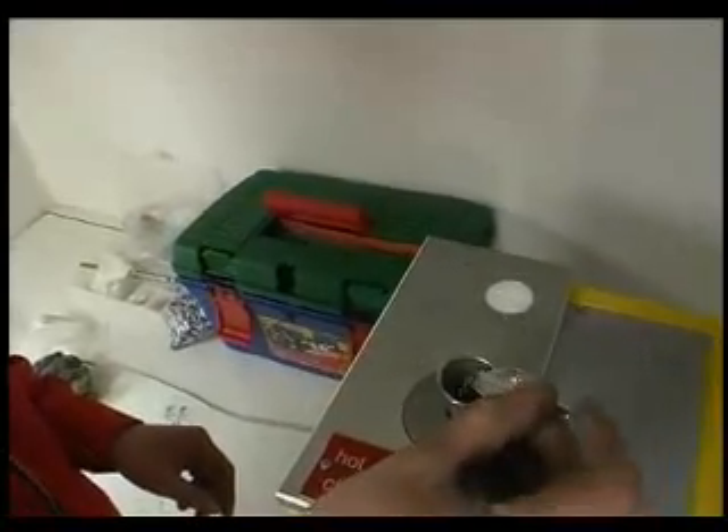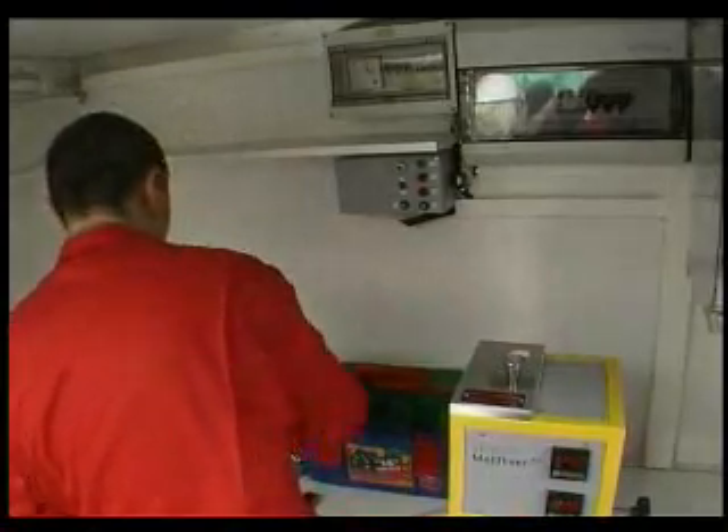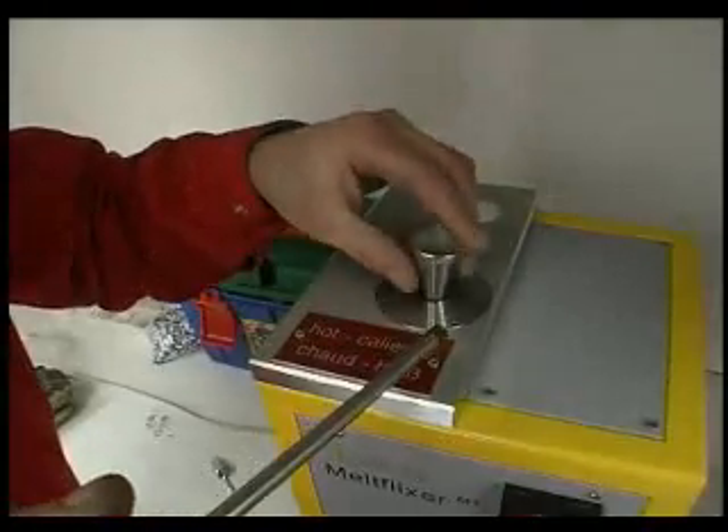The regrind or regranulate is filled into the MFI tester after this has reached its required temperature. The test quantity is densified.